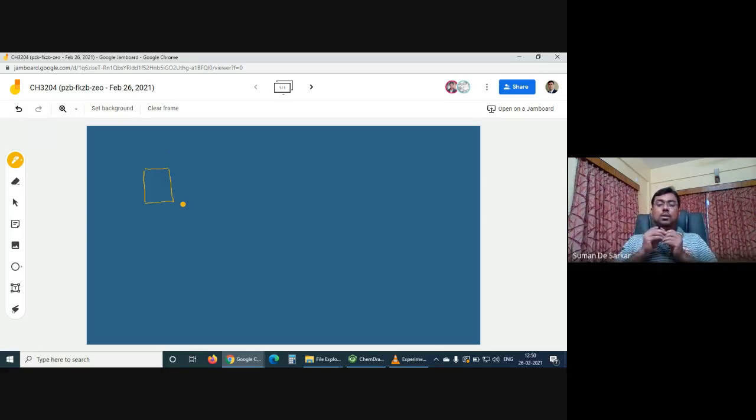Okay. So what we'll do, we'll take out a little part from the reaction mixture, and then point it on the TLC. So in a typical TLC, we do like this. Whenever you have this plate, this is a silica plate. The ideal thing is you put a pencil mark here, and then you put 3 pencil marks here.